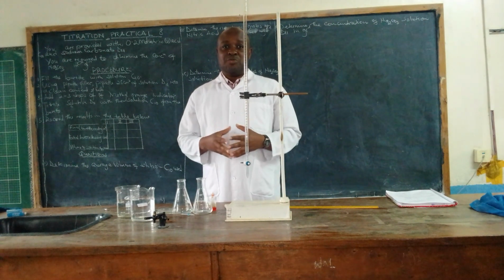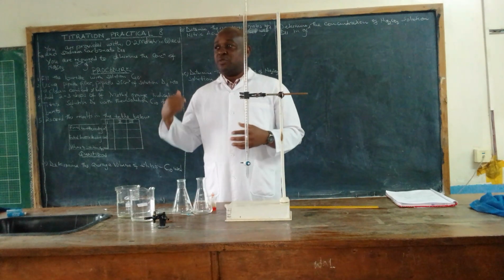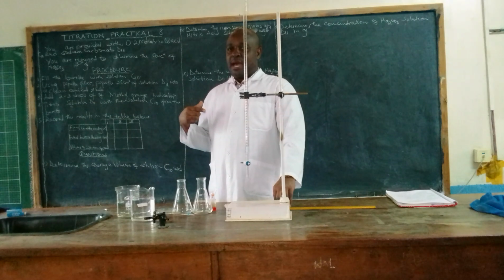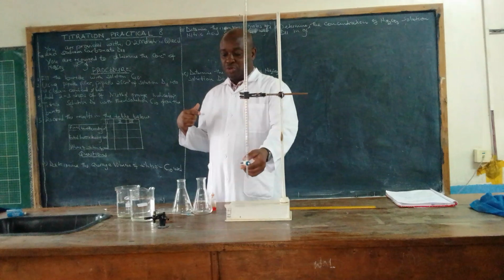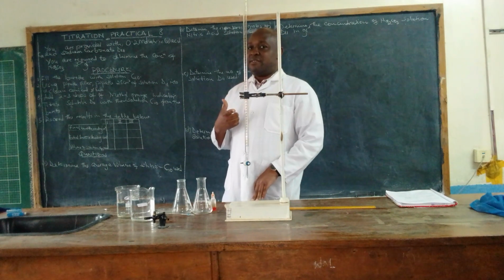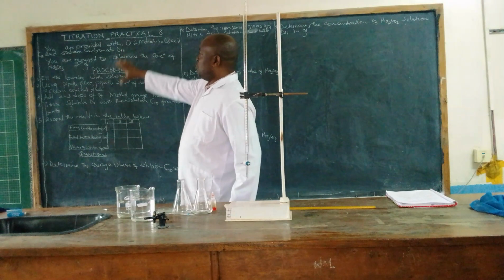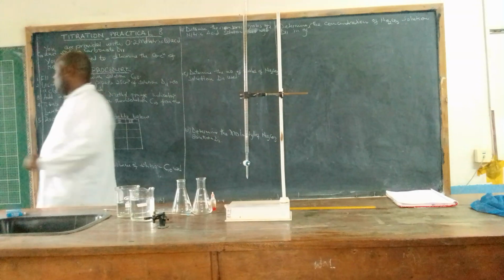Today we are just going to continue with our normal series for the volumetric analysis, and in as far as titration is concerned, we are going to do a demonstration practical for titration. So now we shall just go to the procedure directly. That is titration practical 8, and I'm just going to take you through the procedure so that you can be able to embark on the practical itself.